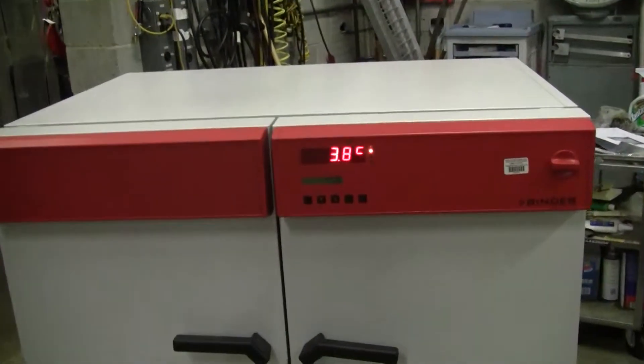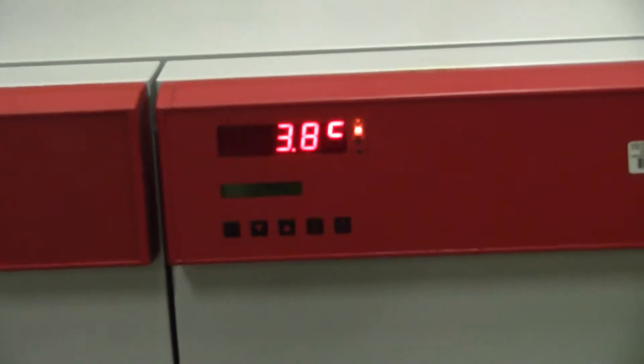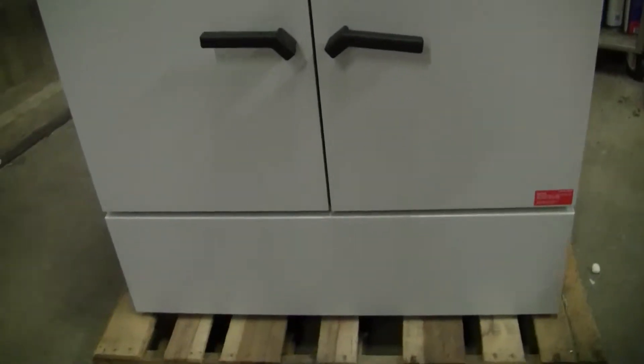This particular incubator is set at 3.8 degrees Celsius, holding quite steadily, nicely. It's in excellent condition.